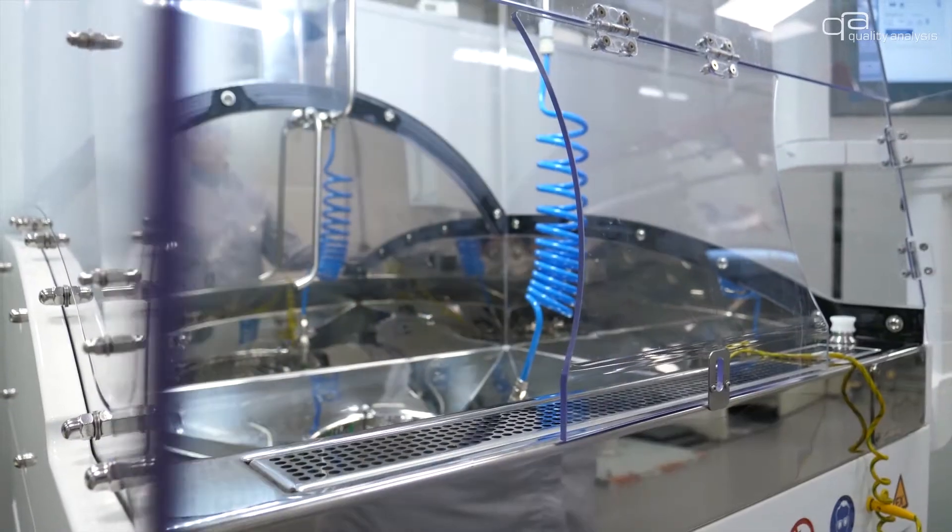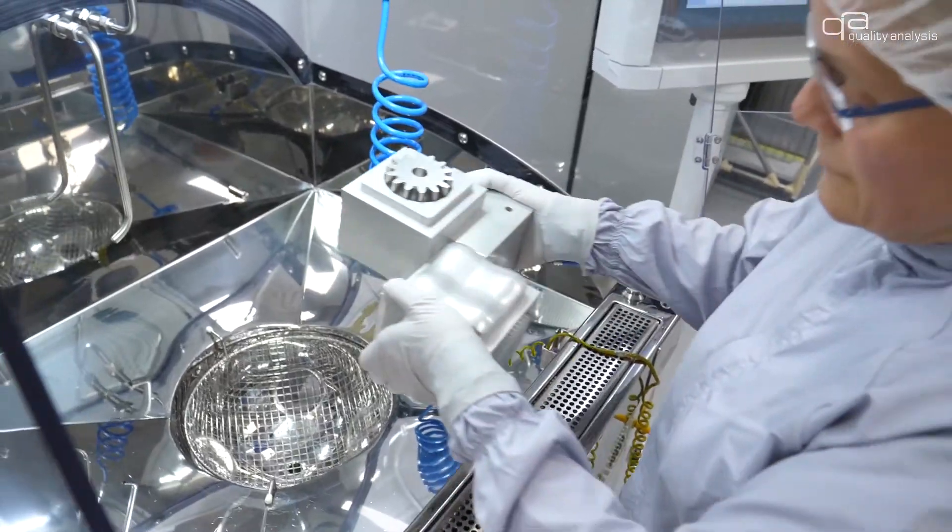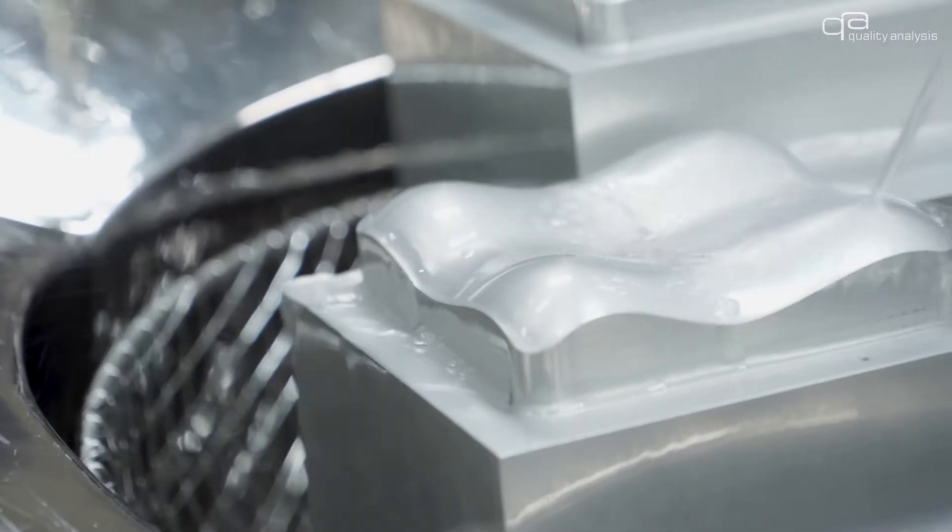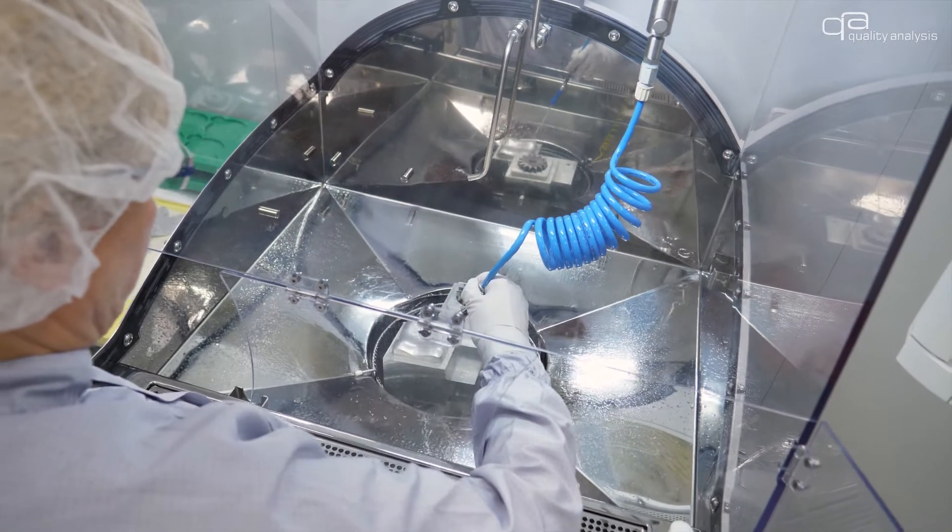For wet extraction the adhering particles are dissolved and collected by spraying, rinsing, flooding or ultrasonication using deionized water or organic solvents.